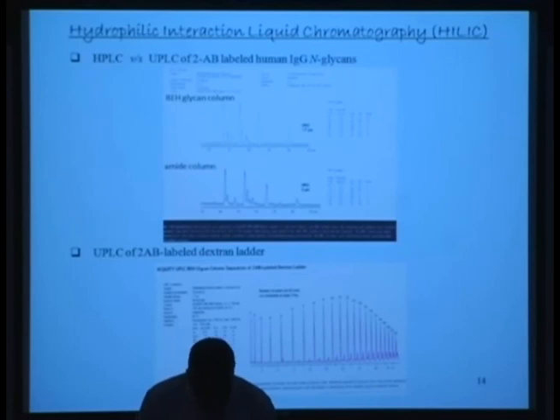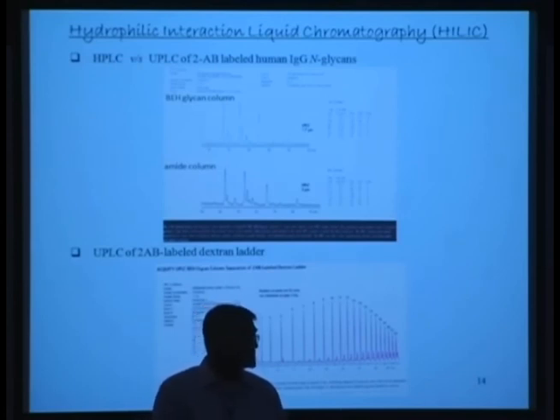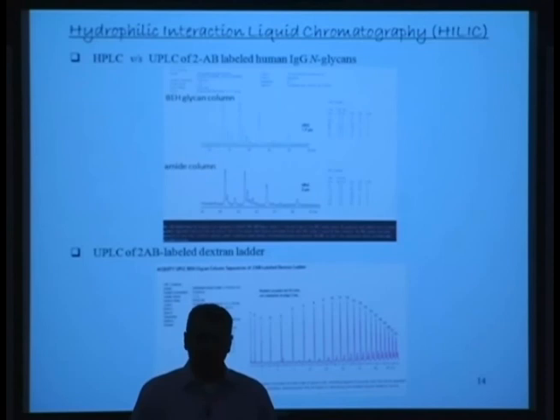The other thing that strikes me is, turn to figure 4. Okay, if you turn to figure 4, you can see that this is a profile of retention time versus the number of hydroxy groups. See that? And look at the profile. I wish that they had drawn a line. Is there an R square given somewhere? R square of 0.983. They also say that is the same for RP, reverse phase ion pairing chromatography, very high. But this particular profile is very striking.